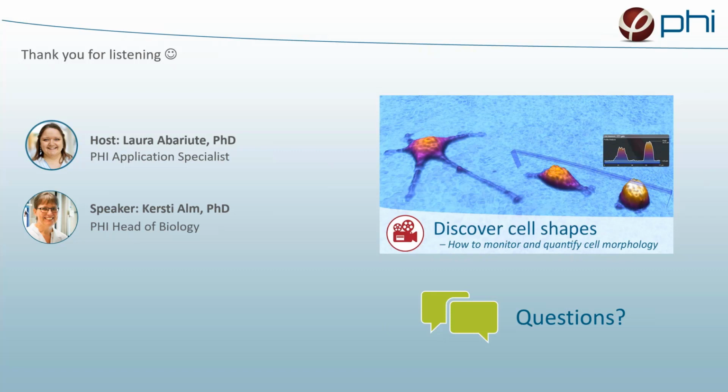Okay, and since we're running out of time, we have time only for one question, and it comes from Germany. Lisa from Berlin is asking, can the images from the morphology be used for other assays, or does she need to redo the experiments? Usually you can pull out much more data from each image. It depends on how often you capture the images. If you have images captured close enough, you can measure cell motility. But we need to be able to follow the cells rather closely to do that. Otherwise, you can always get parameters like cell numbers, cell count, confluence out from every picture. So yes, you can mine a lot of data from each picture.